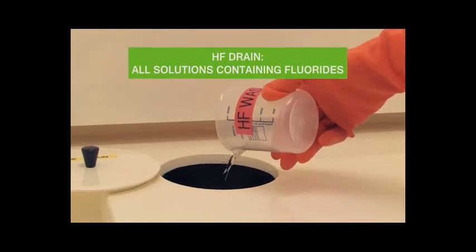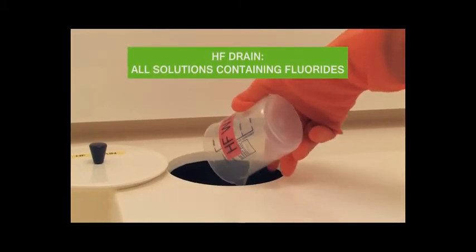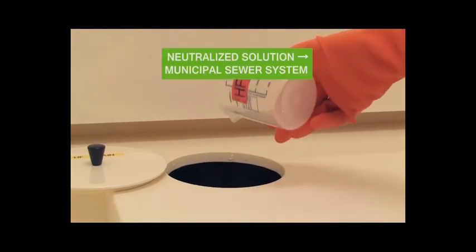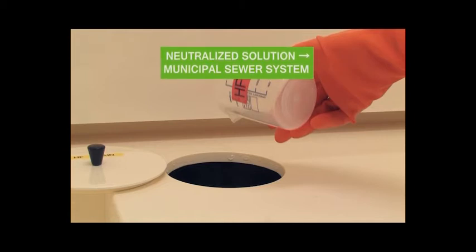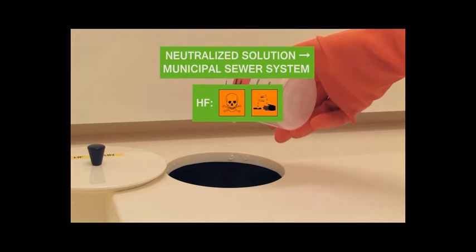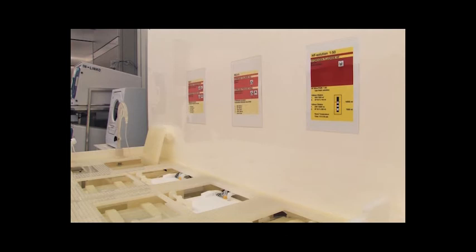All solutions containing fluorides must be disposed of via the HF drain. This restriction is due to the fact that the neutralised solution from the neutralisation drain is fed into the municipal sewer system into which the release of fluorides is strictly forbidden. There are signs at each fume hood and wet bench showing chemicals used and other important information.